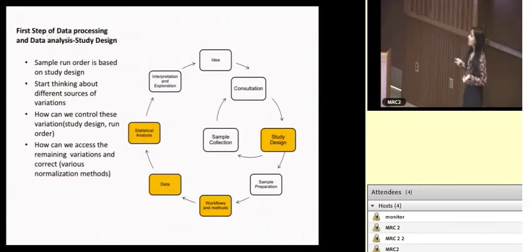And that's where normalization comes in. So why do we want to normalize? We want to normalize because we know that when we are running these samples, we are going to have some variations. So we want to assess these variations and correct them using a correct normalization method.